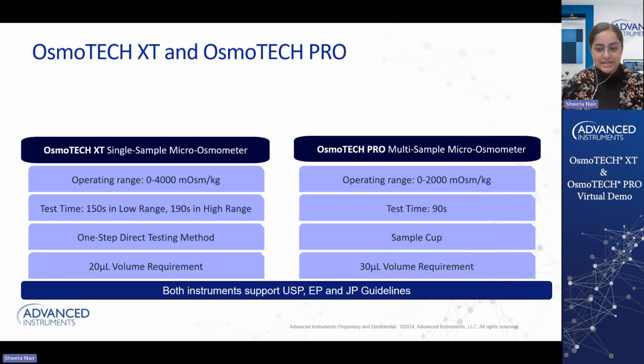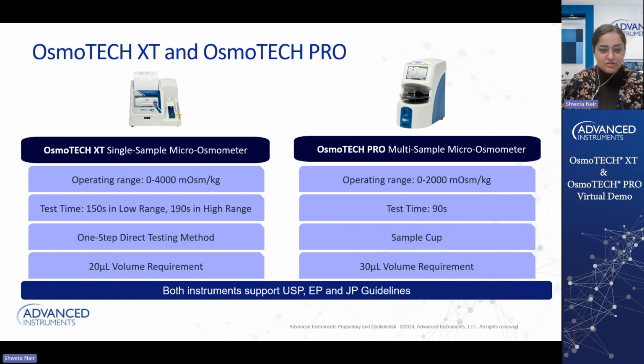So what is the focus today? Today, we will see the OsmoTECH XT single sample osmometer and the OsmoTECH PRO multi-sample osmometer. To compare the instruments, starting with the OsmoTECH XT, this device is a manual single sample test.